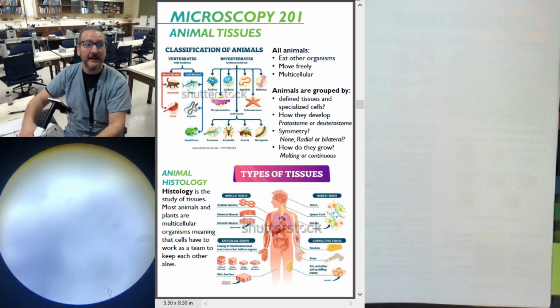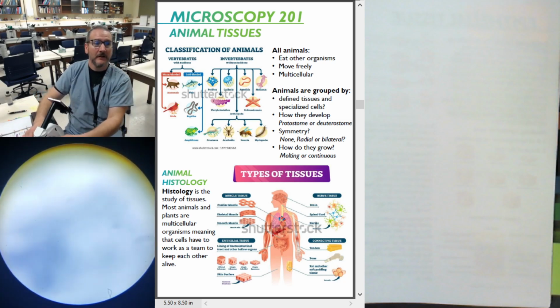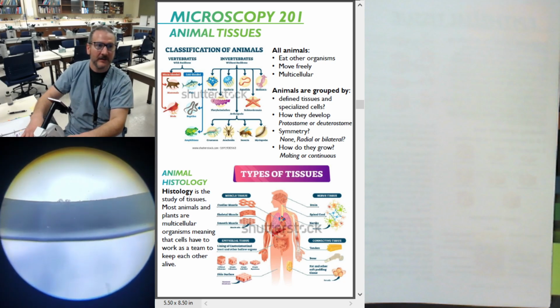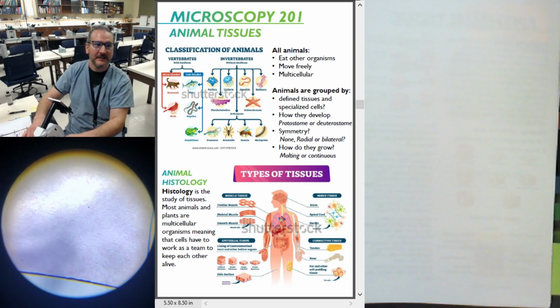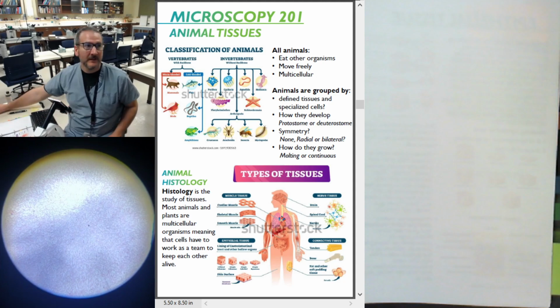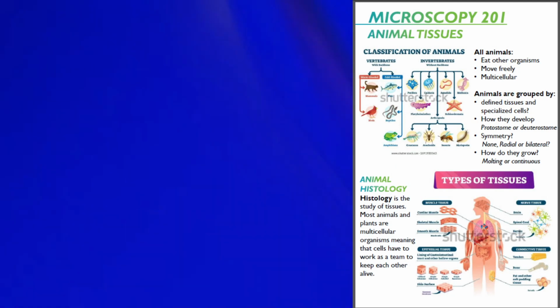So let's slide it back in. Swoop. Oh yeah. Right, and there's the edge of my cover slip. On the right track for sure. There it is. Yep, that square patch is actually what I'm looking for. I'm in. Let's zoom in and see if we can see that a little bit better. Great, yeah. A lot of the specks are already gone, and so is my image. Let me bring that back up.